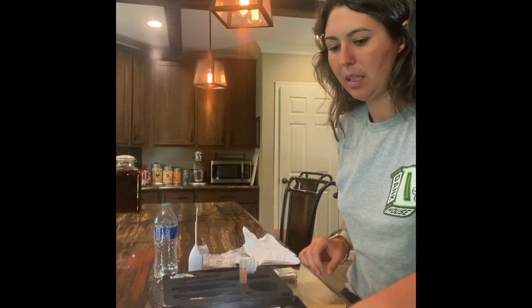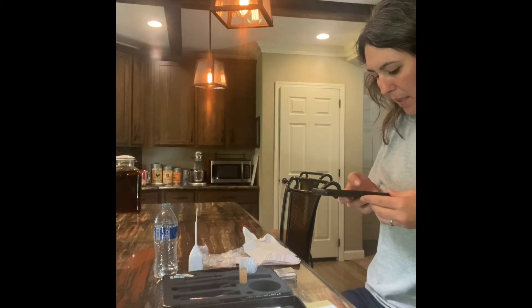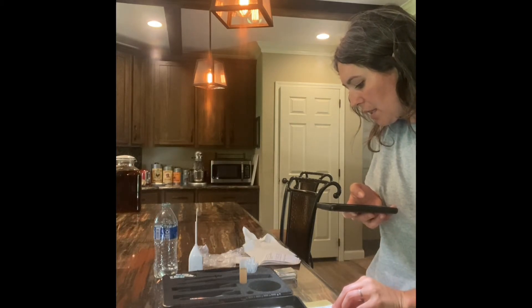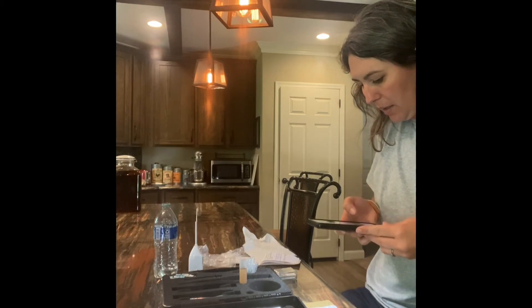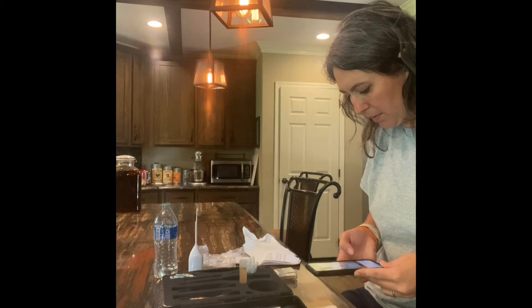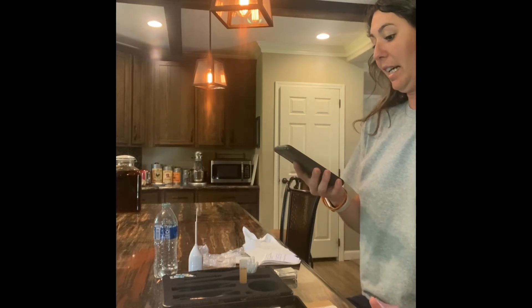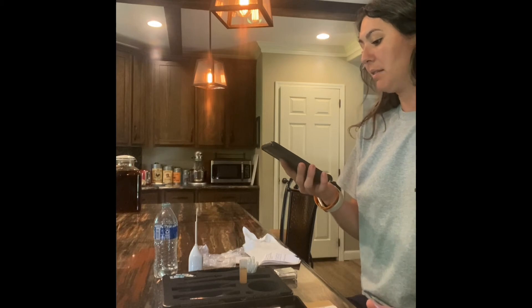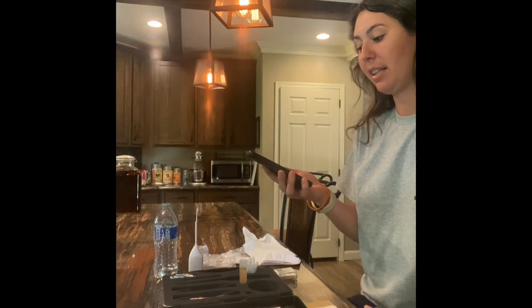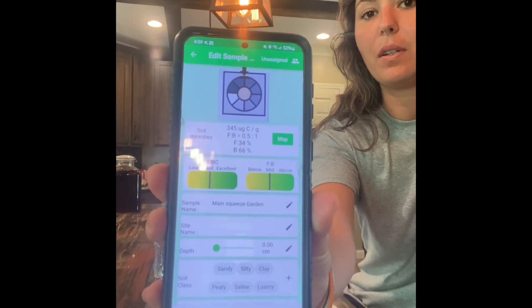Now we're going to use the microbiometer app on a smartphone. Center the strip — start away from the sample so the camera can adjust, then move closer so the squares align. Make sure it's centered and go slowly in. It tells you right away, which is crazy — I don't know how it does that. The microbial biomass content is in the good range. This is what you'll see when the app reads the results — it gives you a range, and his soil sample is right in the middle. Not bad, not great.